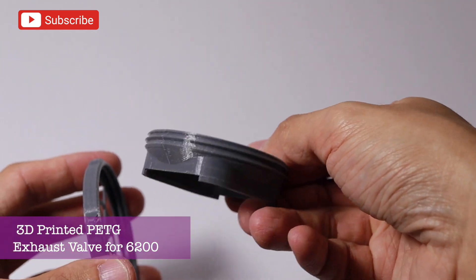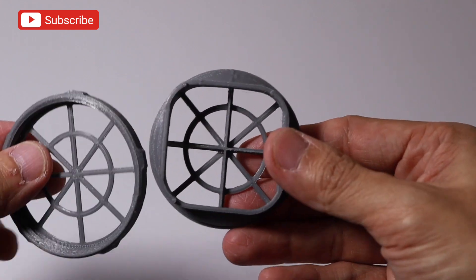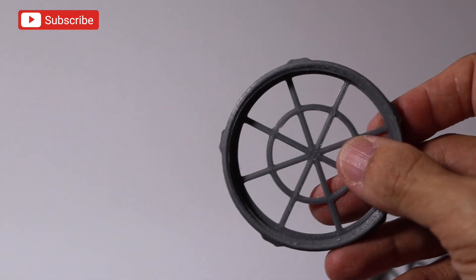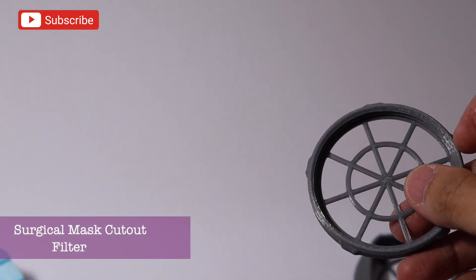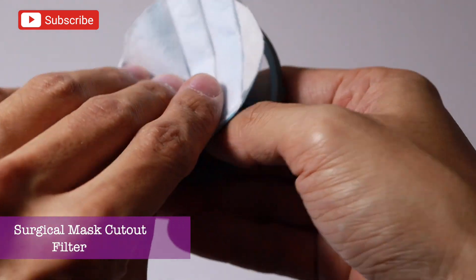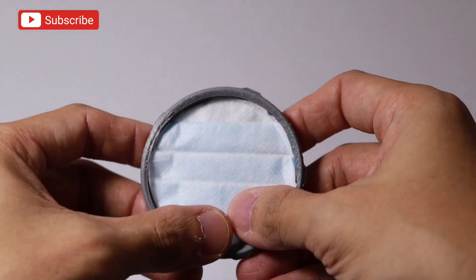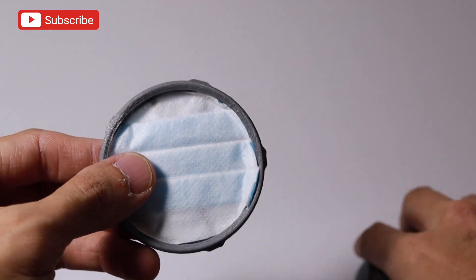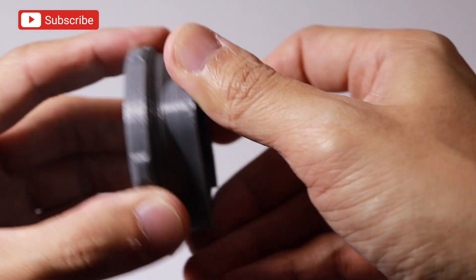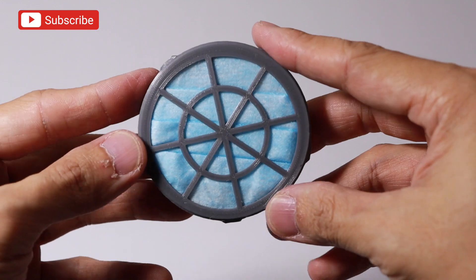This is the 3D printed exhaust valve, PETG pa rin, for the 6200 half-face. There's a slight difference sa shape nya. Still a 2-piece exhaust valve — you can see the pattern. And of course, we need a cutout of surgical mask which serves as a filter. Same pa rin — blue towards the outside of the mask, and the inside part is the white. Parang screw, yung cut lang siya and then pag-tight na, that's secure na.